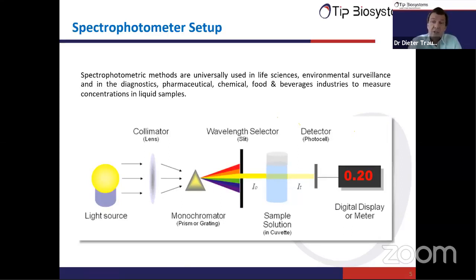And then we mentioned, we want to study the light at a particular wavelength. So this means we have to split the white light of the spectrophotometer into one particular wavelength. And this is usually done with a device in the spectrophotometer that we call a monochromator. So the monochromator creates monochromatic light, so light of one particular wavelength. And that's shown here in the picture. I hope you can see my cursor. And only this monochromatic light, in this case this yellow light, will then enter the sample.